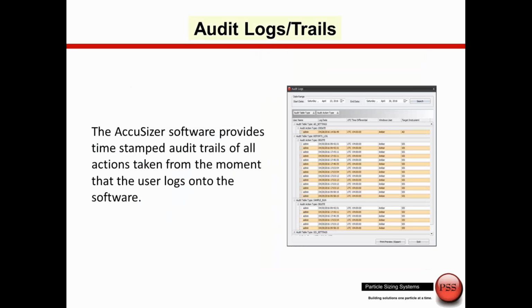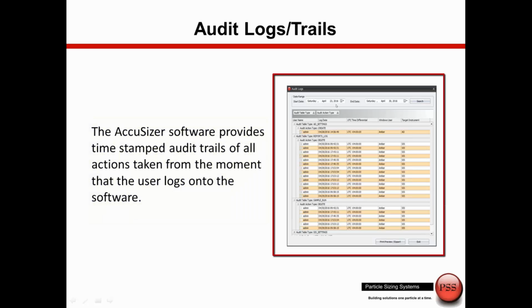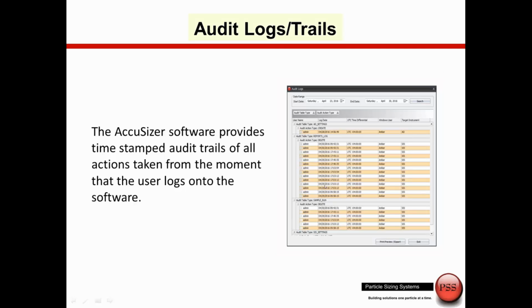We also can have a log of all changes made to the software, and that can just be an audit log or an audit trail depending on if we're in the pharmaceutical industry or just a laboratory who wants to track what's happening with the system. So we see here just an automatic log that anytime anything changes with the system, there's a log to say on this date a security setting was changed or something like that. So a good way to track the control of the instrument so we know if any changes have been made to how it was used.